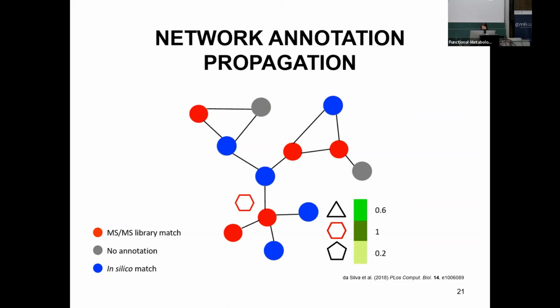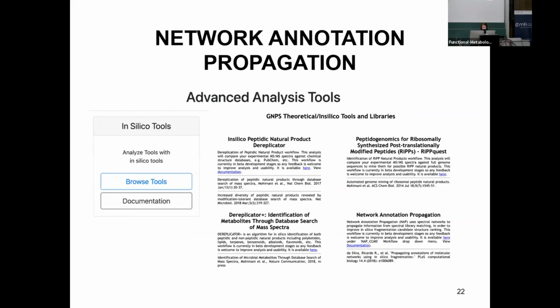In this case, this hexagon would be ranked as number 1 because it's most similar to the neighboring MS/MS library match.